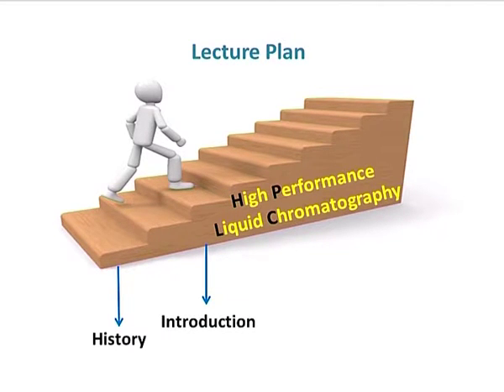We will discuss and introduce the instrument. We will delve upon the theory of HPLC, and towards the later end we would discuss the instruments and the nitty-gritties of the instrument. So, what is HPLC? It is an evolutionary equipment for separation.